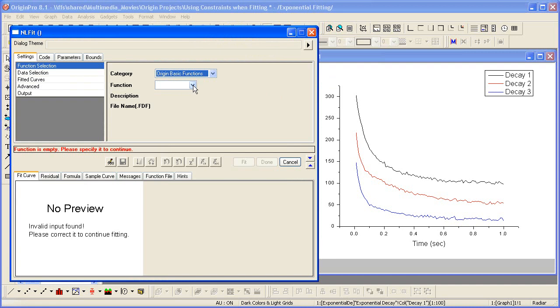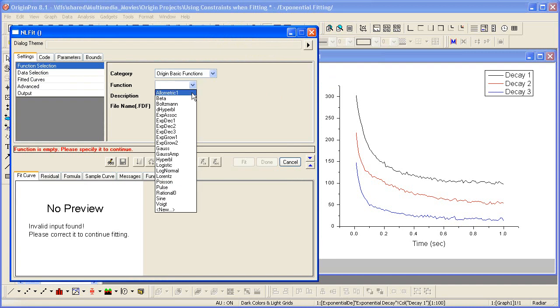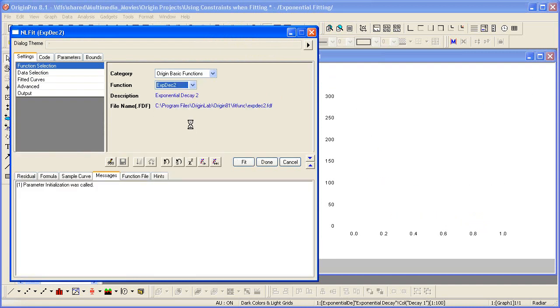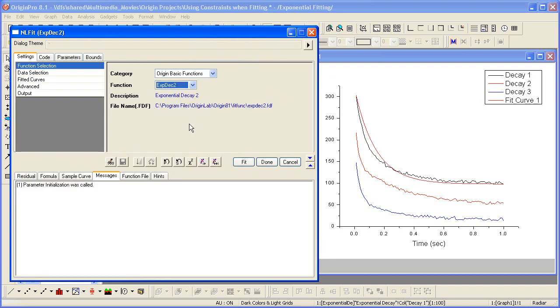The first step is to choose the function I wish to fit with. I then go to the data selection.